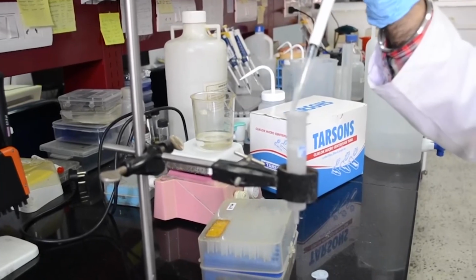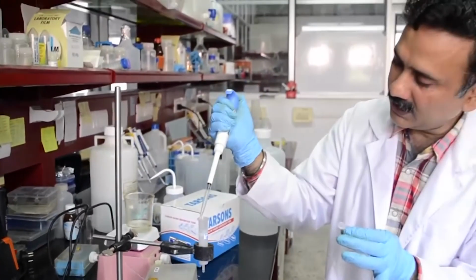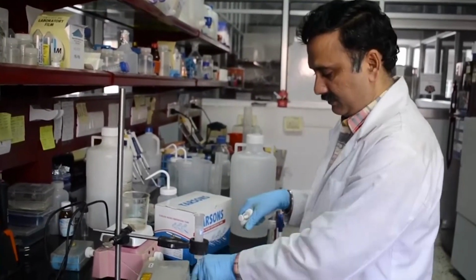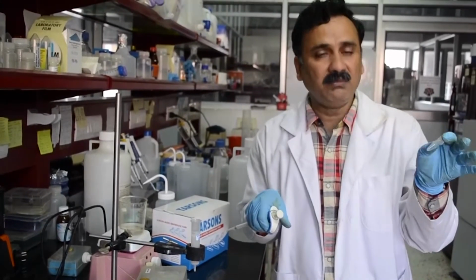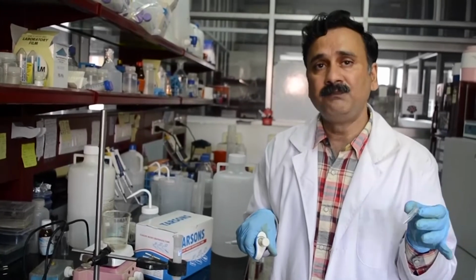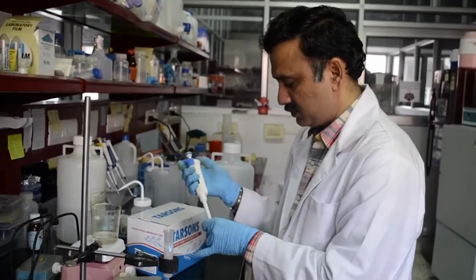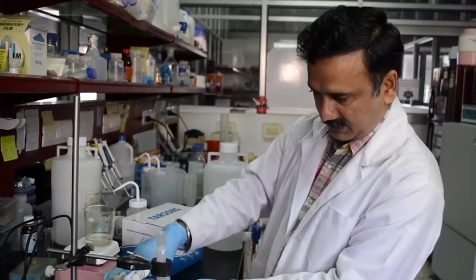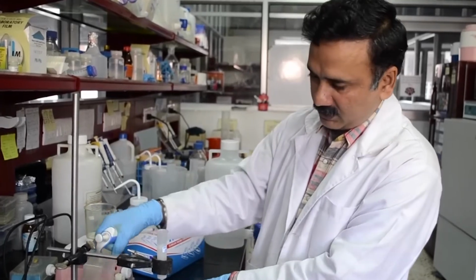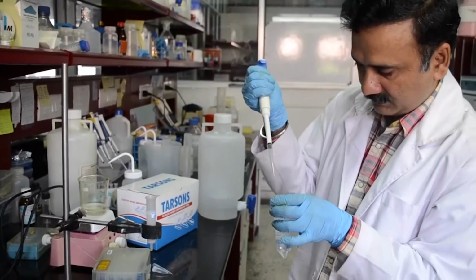Okay, and you have to wait for this protein solution to get into the column. If you are interested, you can preserve some amount of sample so that you can verify what your recovery will be. And once this goes down to the level of the column, we are going to add the buffer or the water.